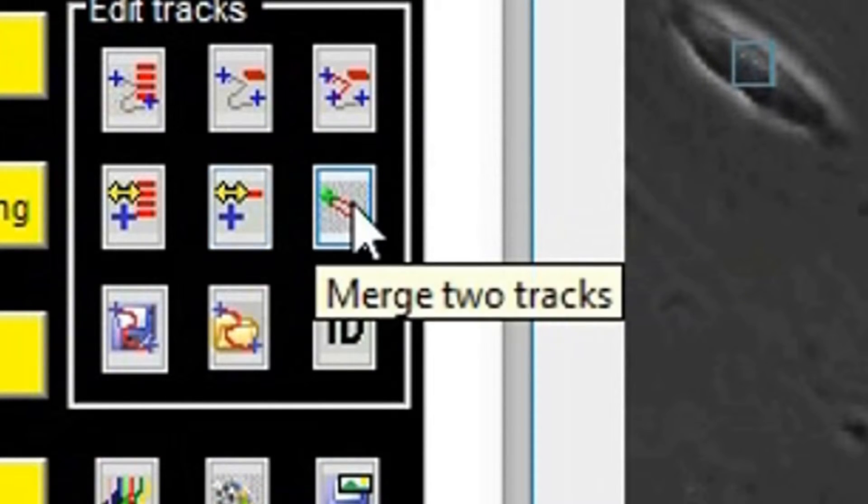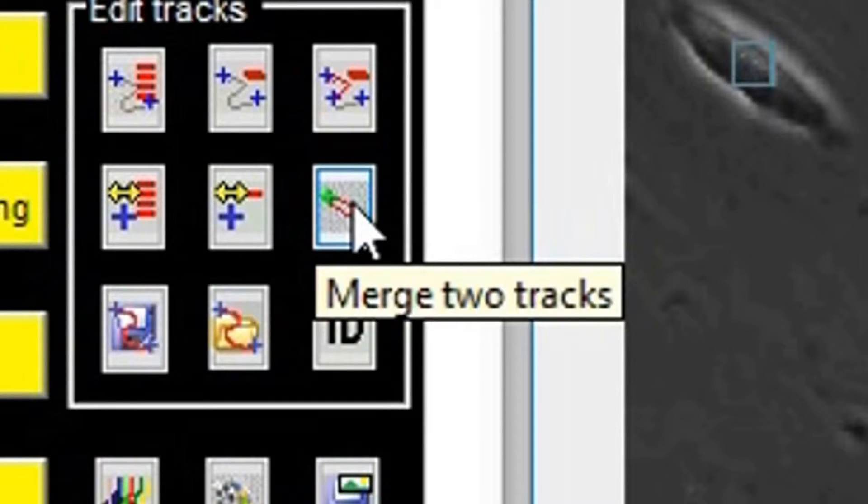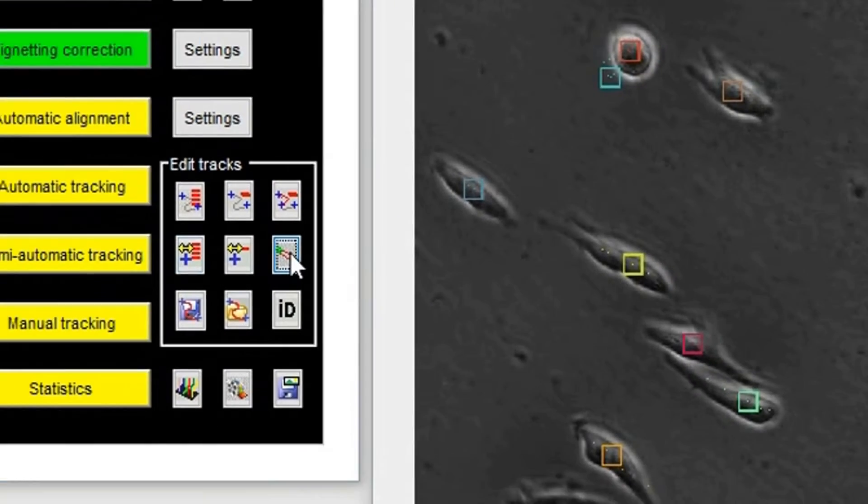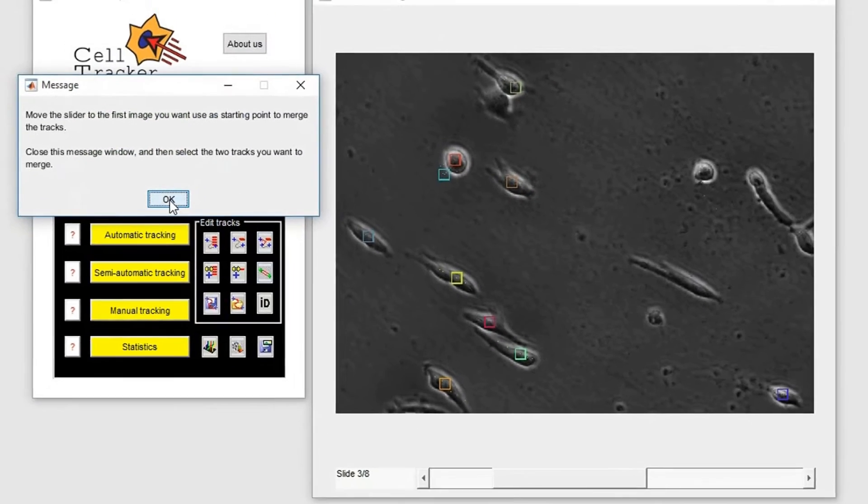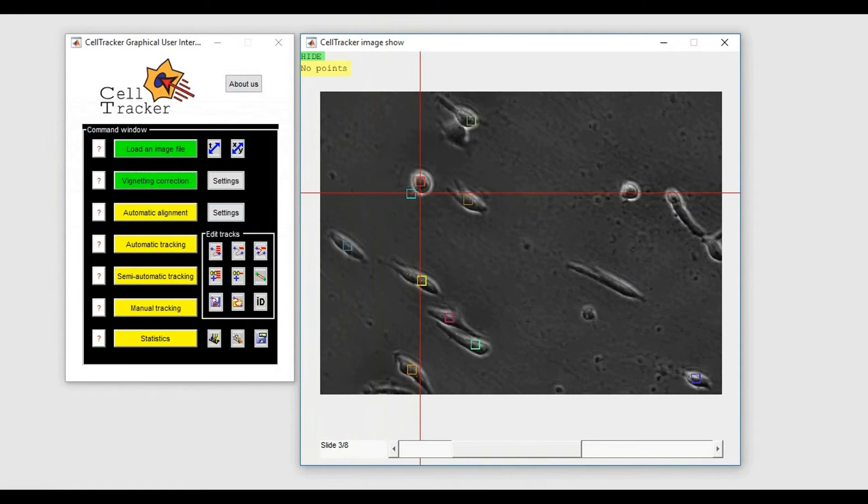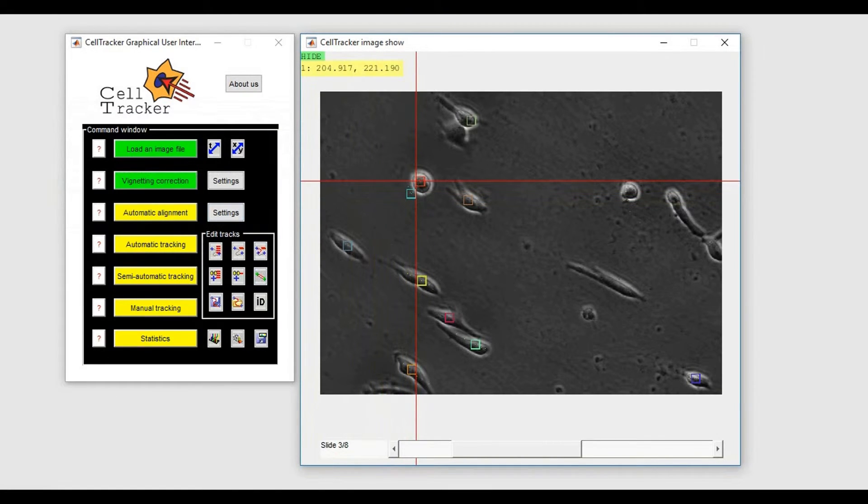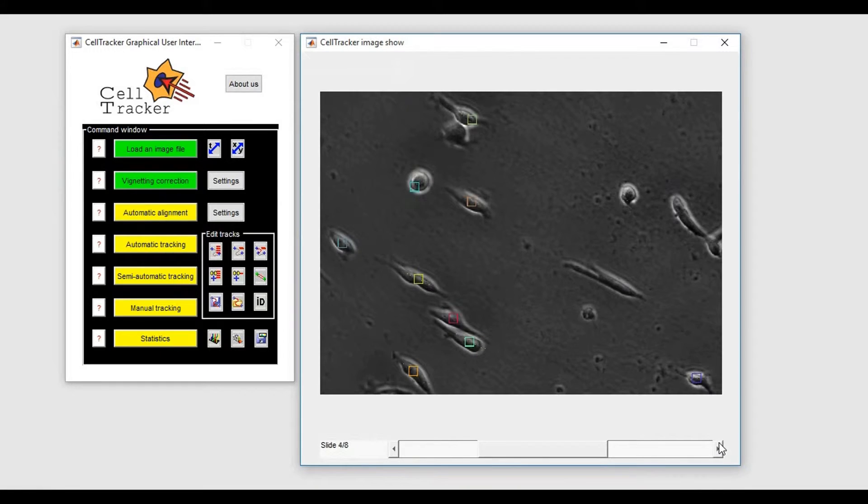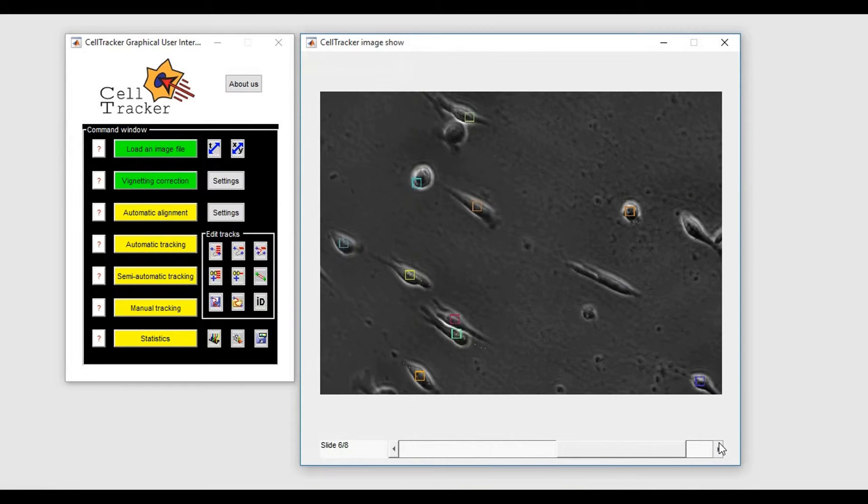To combine two tracks, you can use the Merge Two Tracks button. At each time point, the coordinate of the new track will be the average position of the two old tracks.